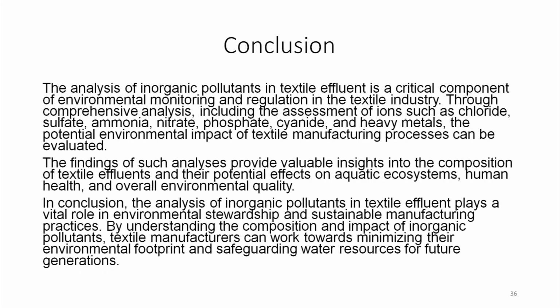Because why are we doing this exercise? We are doing this exercise in order to assess the inorganic pollutants that are present. Only when we know the analytical results of each of these parameters, that is ammonia, sulphate, chloride, nitrate, phosphate, cyanide and heavy metal content in the effluent, we will be able to know whether or not this water should be discharged into the water bodies.